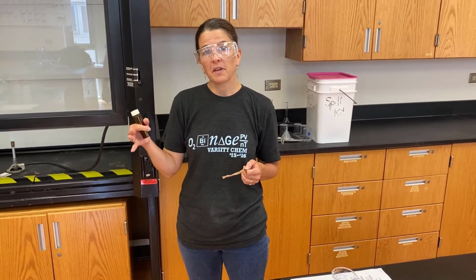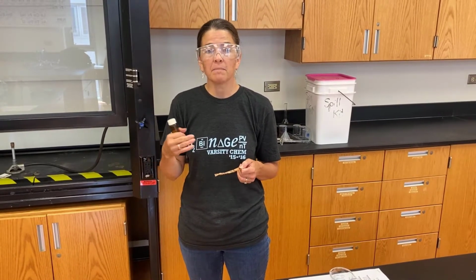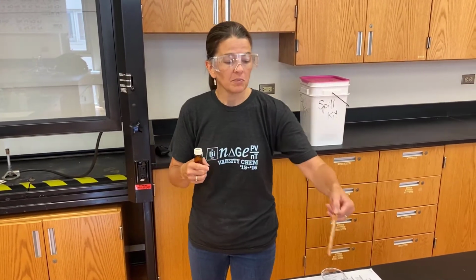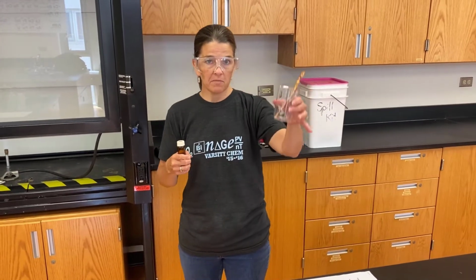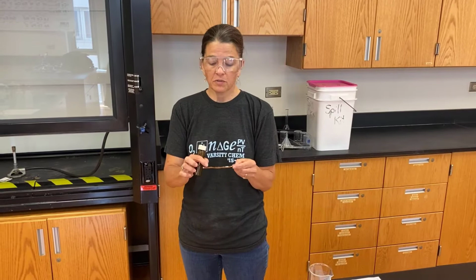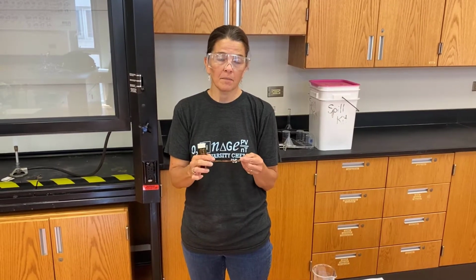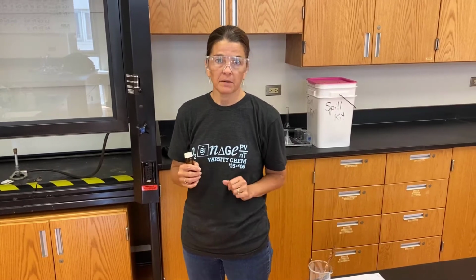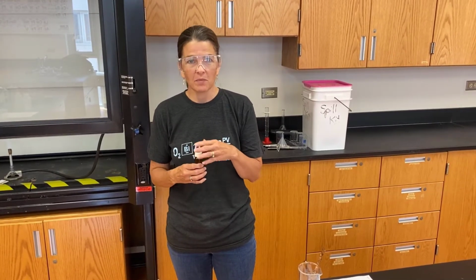Some of the iodine will vaporize away, and you'll be able to see that, and part of it will actually react with the copper and form a compound on the surface of the copper. We're then going to put it back into the beaker, and you'll have a mass at that time. After that, we're going to gently scrape away that copper compound, and once again, mass the entire thing. Okay, so that's our process. Data, however, will be given to you the entire time. What I want you to see is what the reaction would look like when we actually did it.